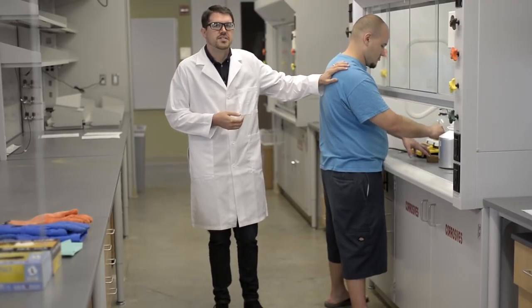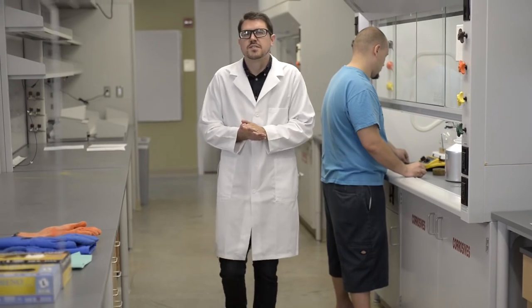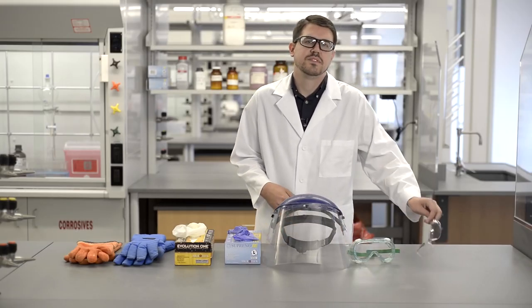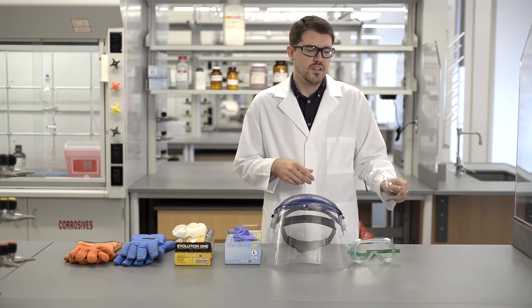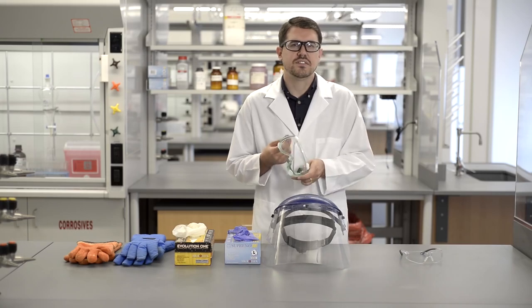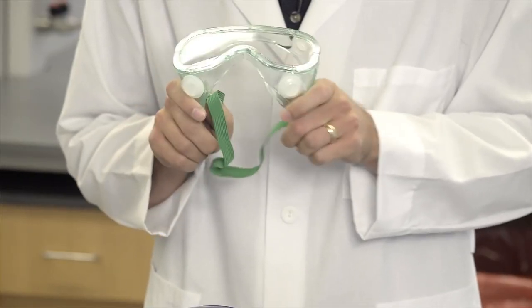Petko here is the perfect example of how not to dress. Now let's discuss some other forms of personal protective equipment. When working in the lab, safety glasses or goggles are required to be worn at all times. If you're working with high volumes or volatile substances, then chemical splash goggles are appropriate.